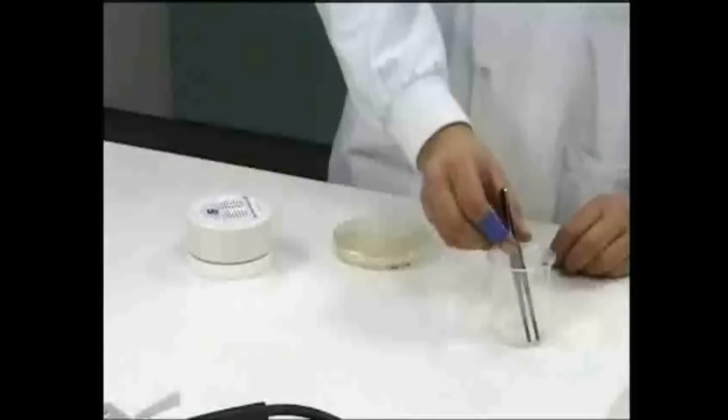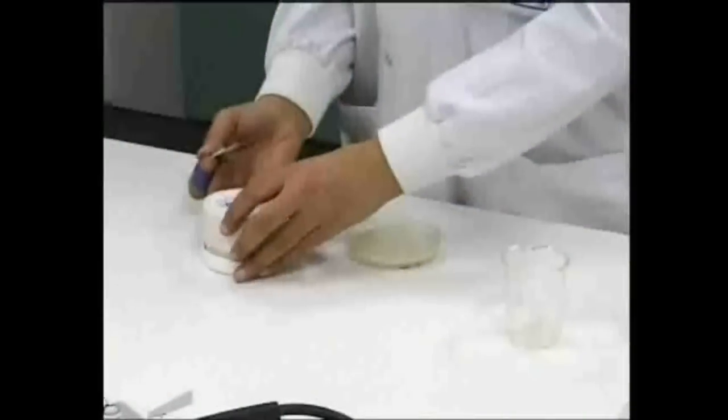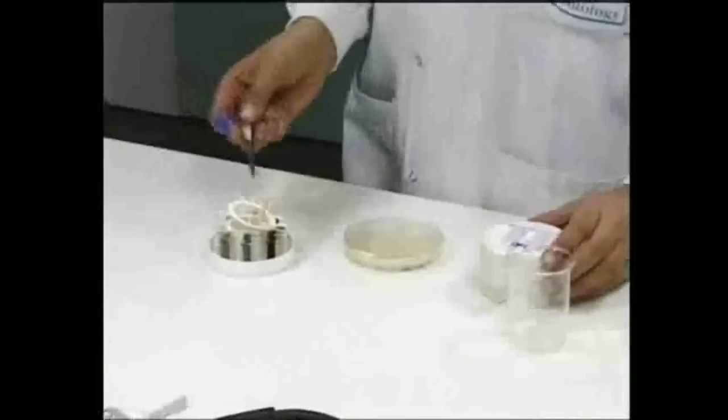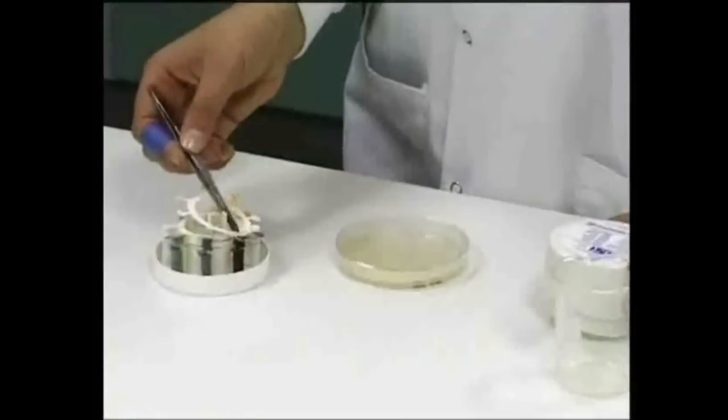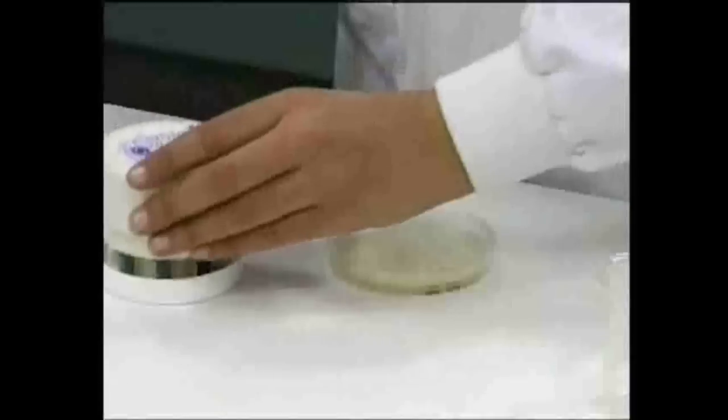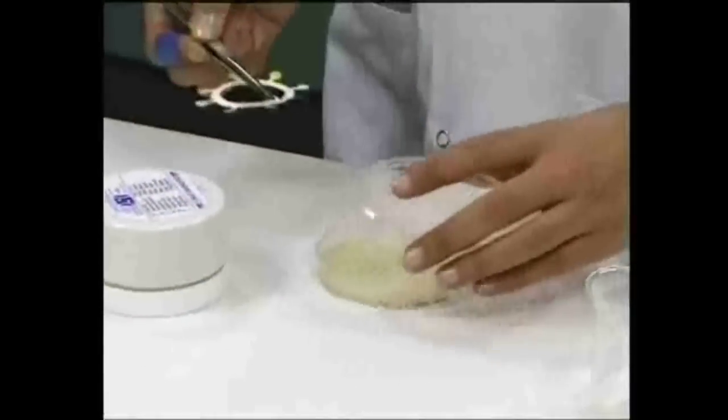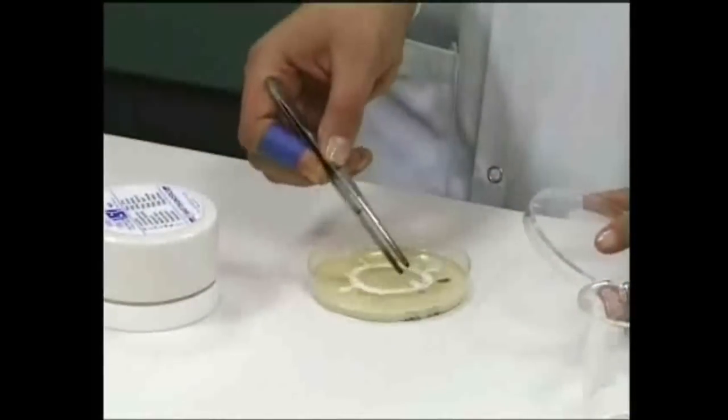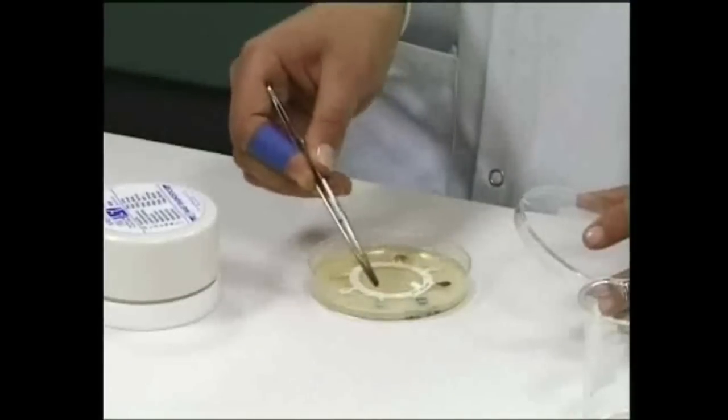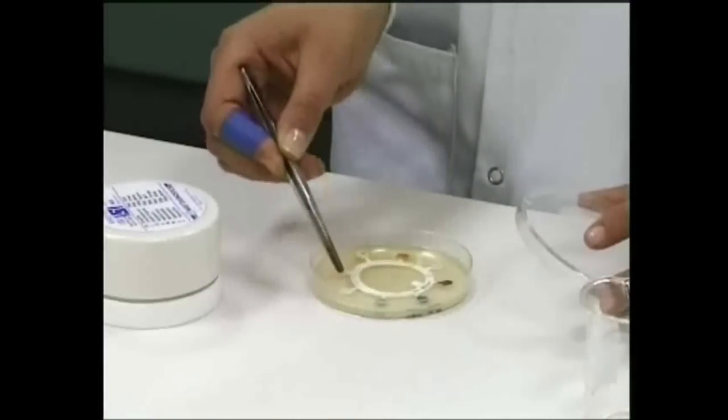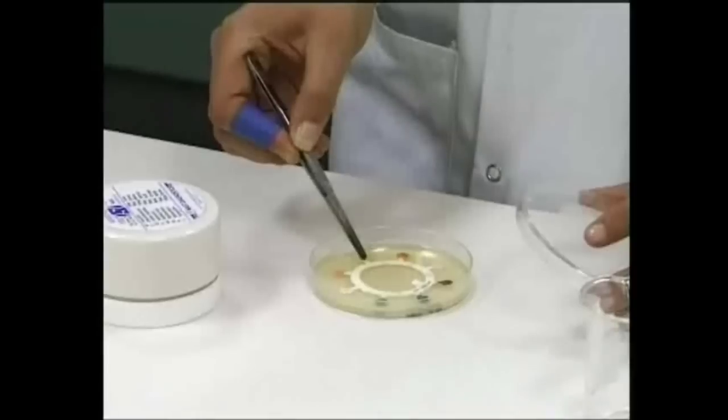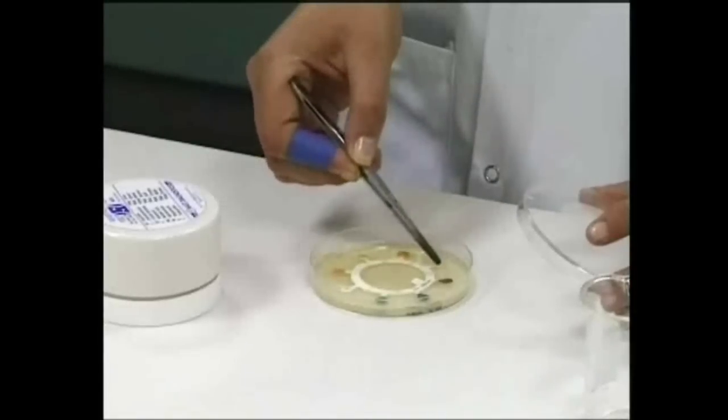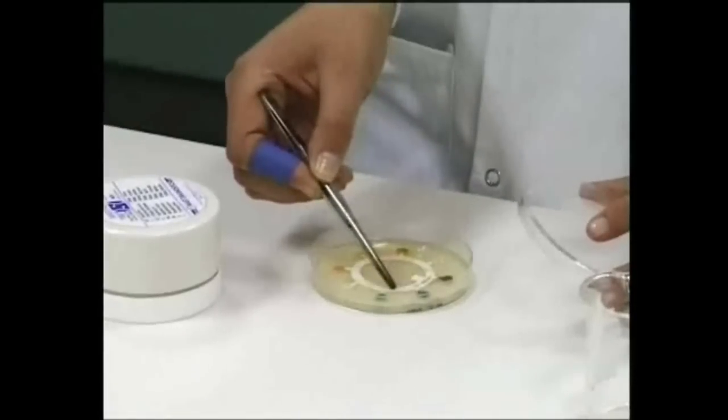Alternatively, the substances may be impregnated into sterile discs of filter paper. Inhibition due to antibiotics is demonstrated by placing paper discs containing antibiotics onto the surface of the agar. Clear zones around the discs or wells demonstrate inhibition of growth.